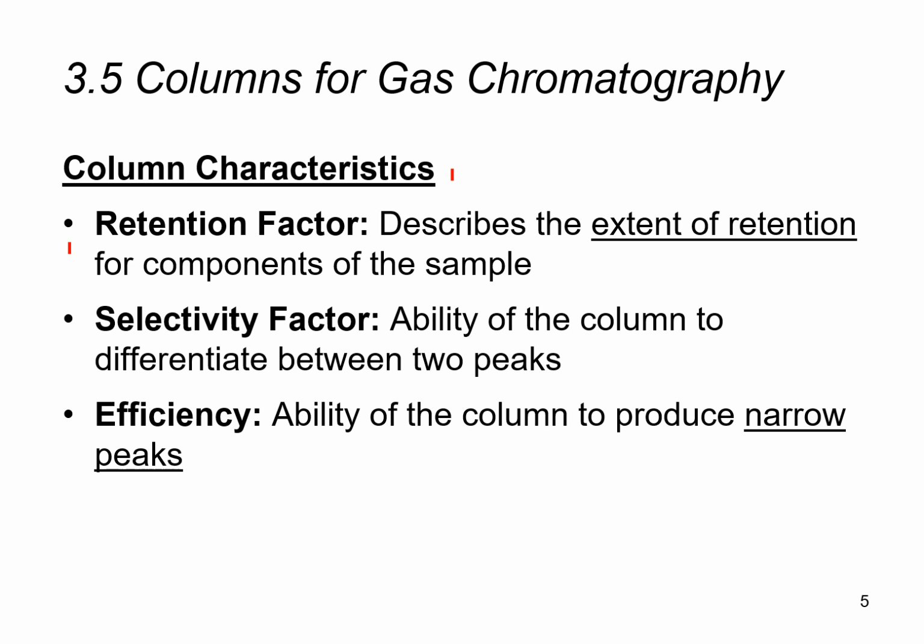So retention factor describes quite simply how much the various components are retained in the column. Obviously, when we use a certain column, we want to generate retention because only with retention of the various chemical components can we end up with decent separation, right? So we need to take a look at the retention factor to see whether it's sufficient for the various components in the sample. That will lead us to the ability to generate separation.